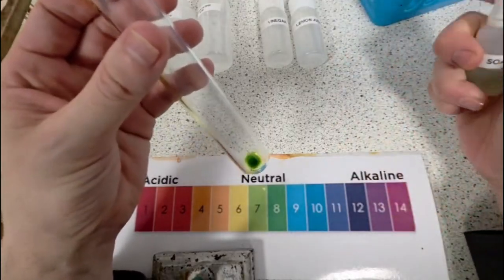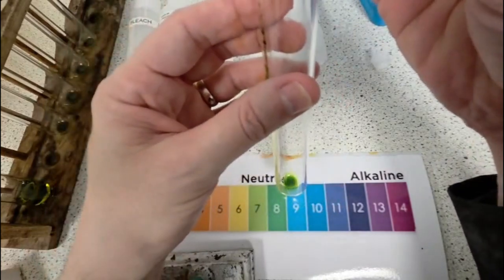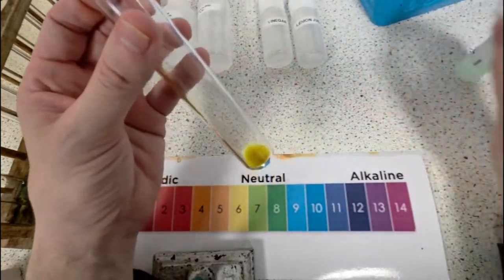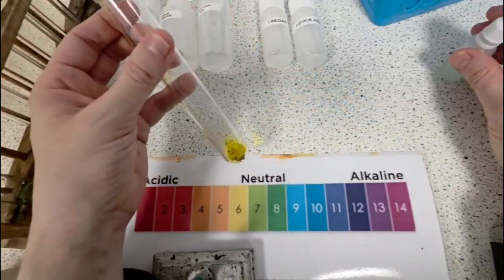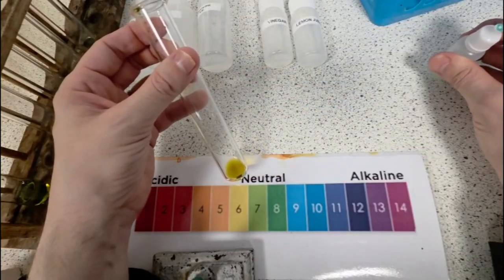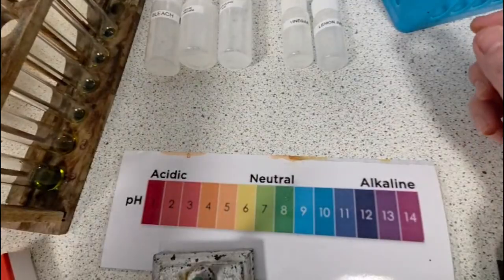Now next, we'll test the soap. So again, I'll undo this and put a small amount of soap into the boiling tube, and we'll see what color the universal indicator turns. Now by looking at that, you've seen it's gone a yellowy shade. This soap is probably pH 6 on our scale. Let's move on to our next chemical.